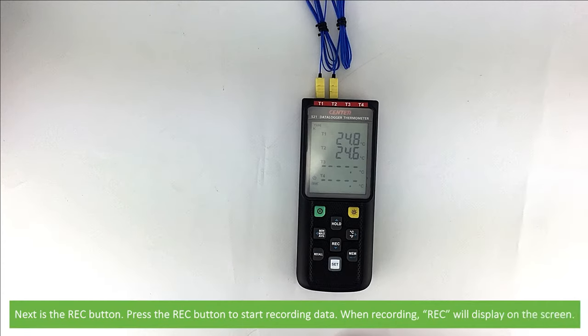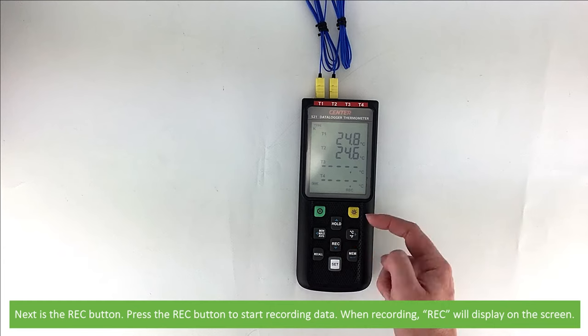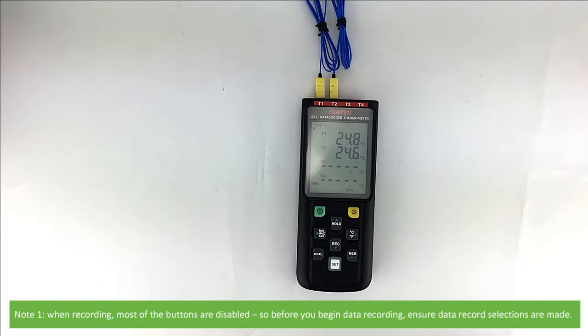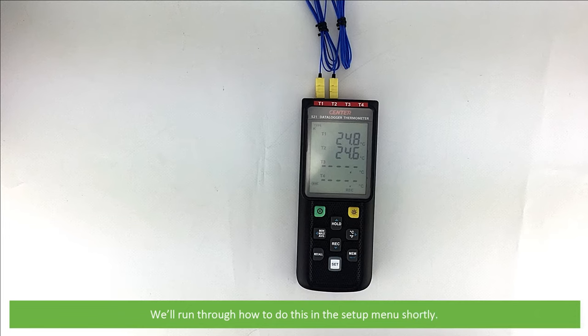Next is the REC button. Press the REC button to begin recording data. When recording, REC will display on the screen. Note that most of the buttons are disabled during recording, so before you begin data recording, ensure data record selections are already made. We'll run through how to do this in the setup menu shortly.